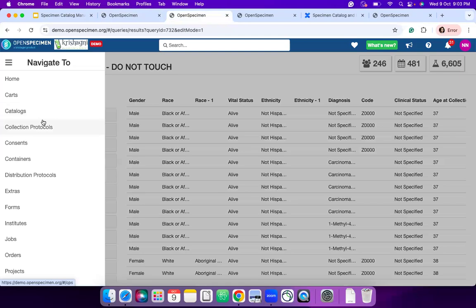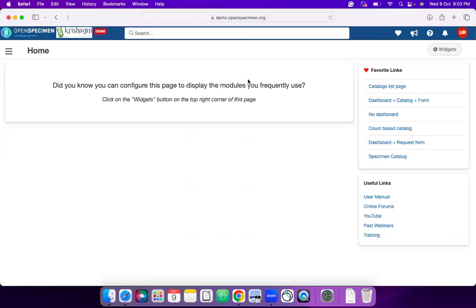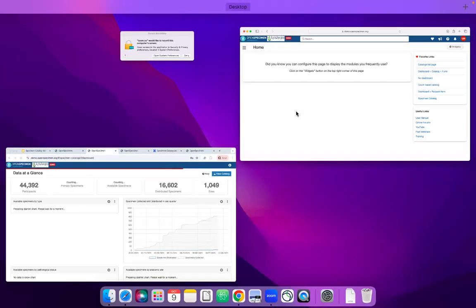Can you try with the test environment? There will be multiple catalogs there. I have my data set up over here. Oh, okay. Just give me a couple of... Yeah. Seems like I've accidentally logged myself out only with the researcher account enabled.